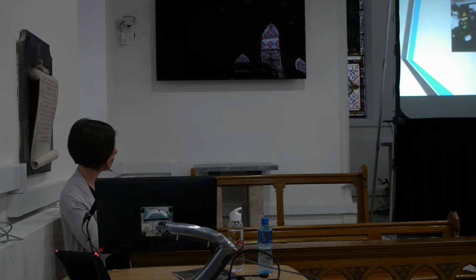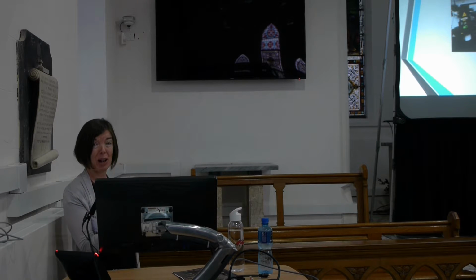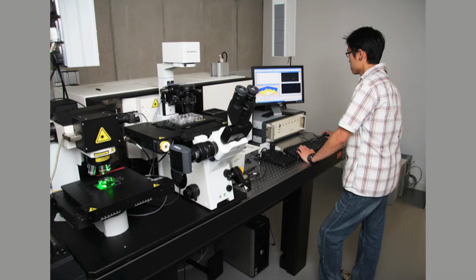So these are pictures of actual Raman instruments that we have in the Focus Institute in DIT in Kevin Street. This is one of the high resolution Raman systems, and you can see it's a fairly big system. It's got 2 microscopes, it's got a couple of lasers back here, and all the optics at the back there. So this will be the typical sort of system that people would use for material science, physics, chemistry.